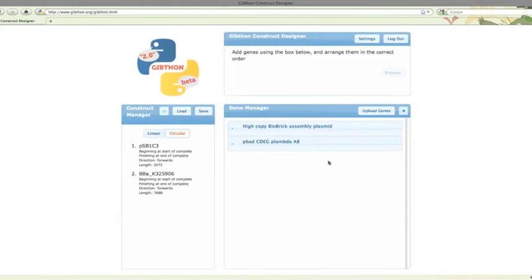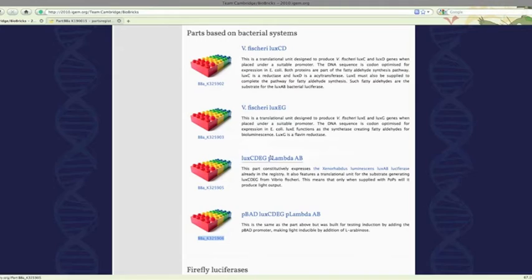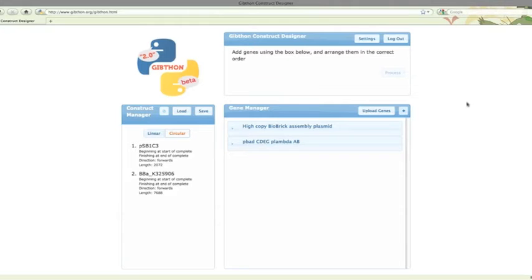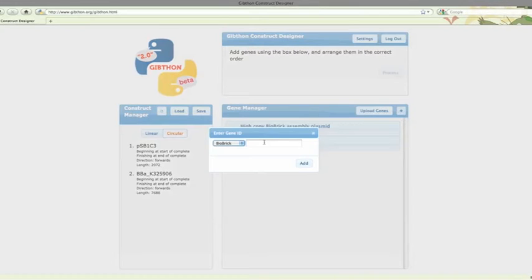Lastly, the arsenic promoter. Same thing from the registry itself this time though. Copy its ID across, and it's sorted.